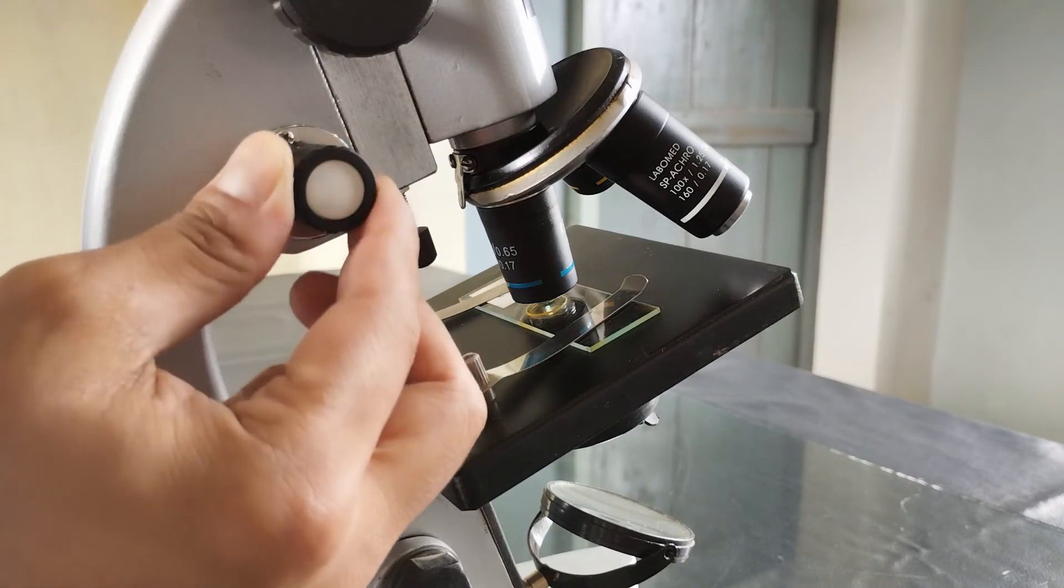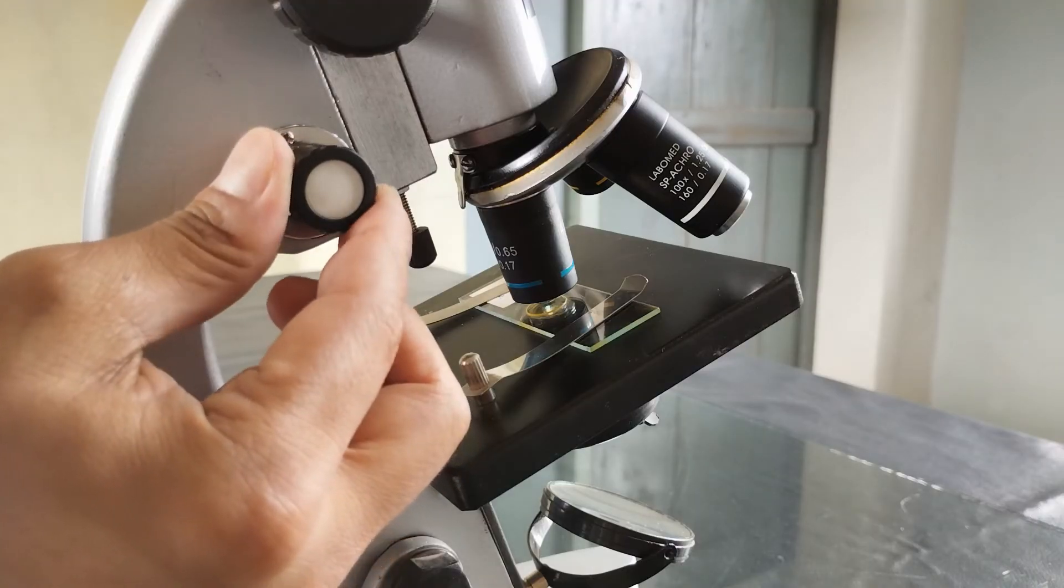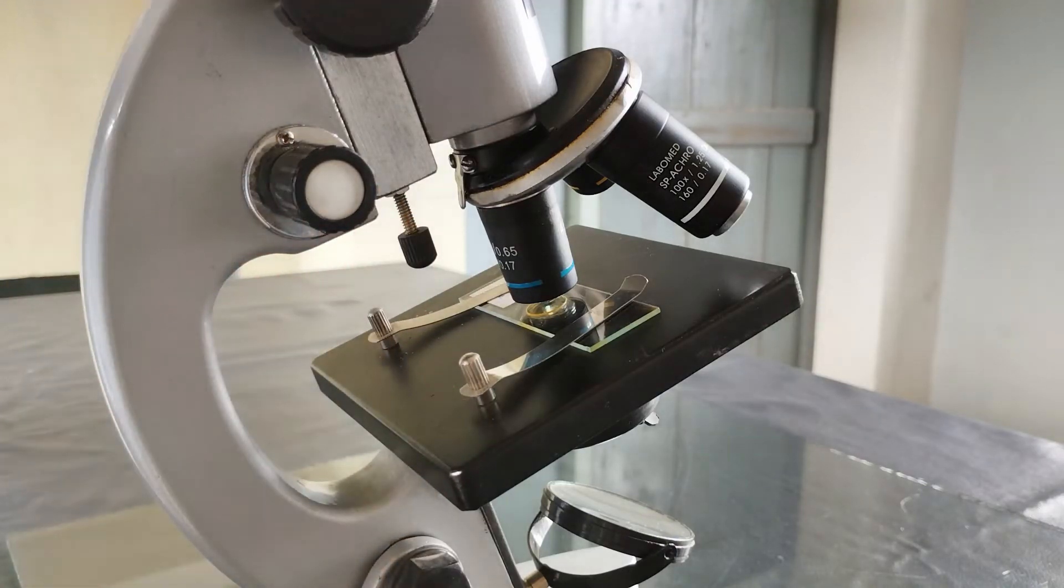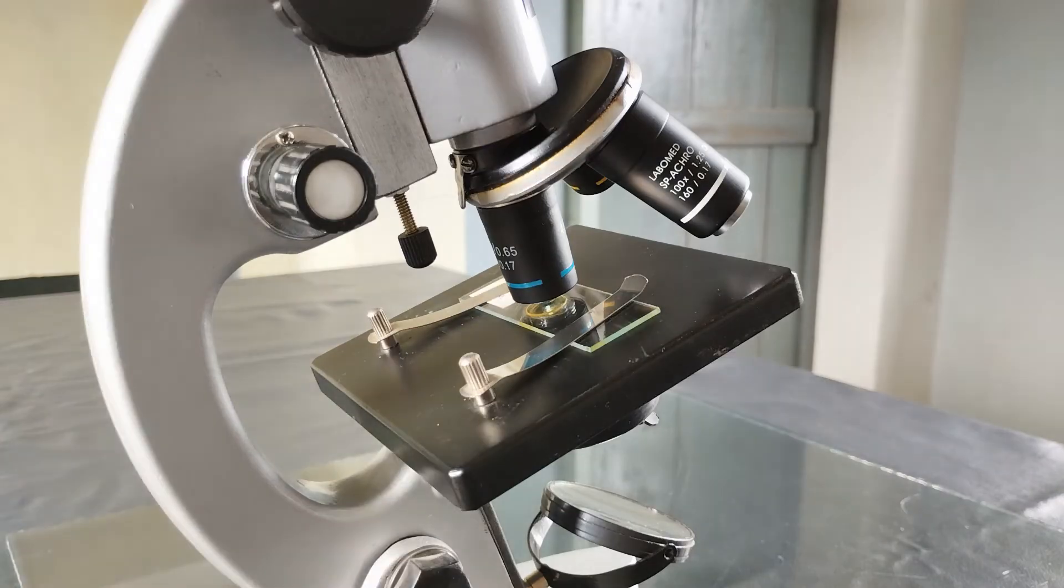As the focusing distance for high power objective lenses is barely within a millimeter region, using the coarse adjustment knob with high power objective lenses can result in accidental overshooting of the lens by ramming it into the slide surface, resulting in breakage of the lens and or the slide.